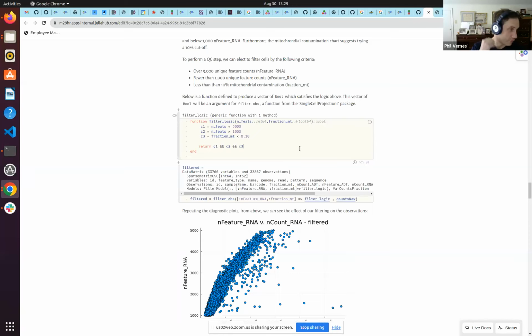And there's actually a really important reason why you need to do that, because as we remember, this is high dimensional data. It's not just a 2D matrix or data frame where you can just filter things. There's observational data associated, and there's annotated data associated with every entry in that count matrix. So if I'm filtering something out, I'm actually changing the associated annotated data.